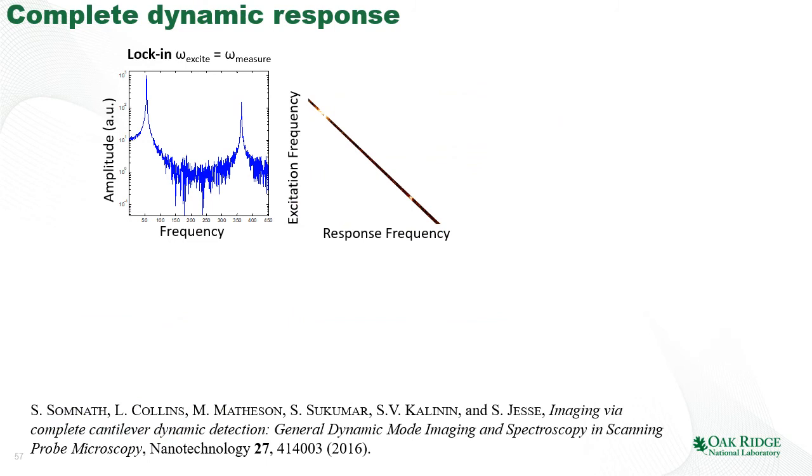Now, how can we drive the detection further? One of the obvious approaches in the excitation and detection is that I mentioned that with the G-Mode, we detect at all the frequencies, but we excite only at one frequency. So what will happen if we excite all frequencies sequentially and detect at all frequencies for all frequencies?